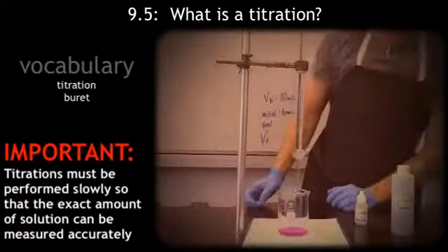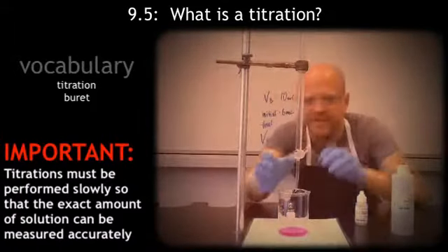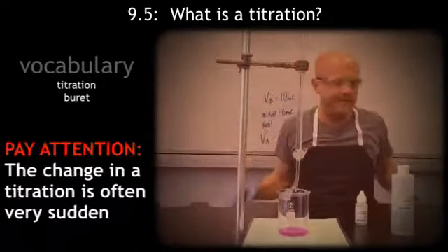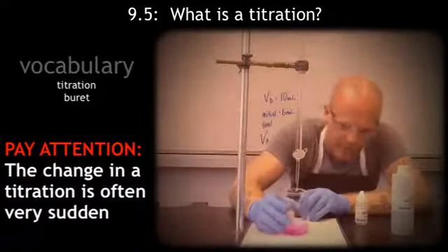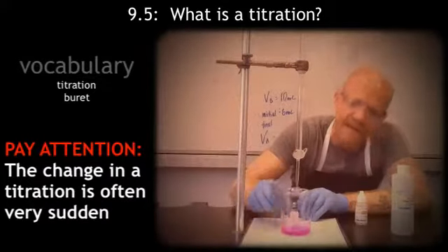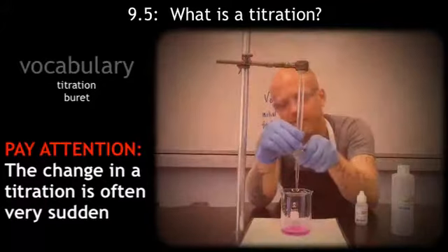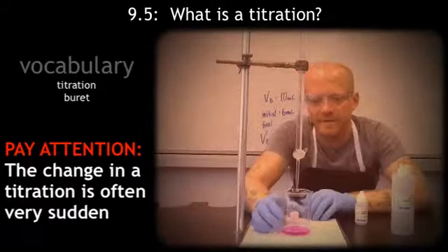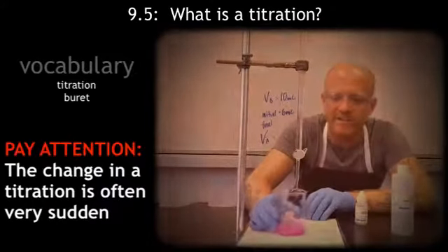So I've added 1.5 milliliters, nothing changed. There is a point that you can get it to go dropwise, and you're going to slowly swirl this, and you see it's not changing. I'm going to open it up a little bit. So now it's going drop by drop.